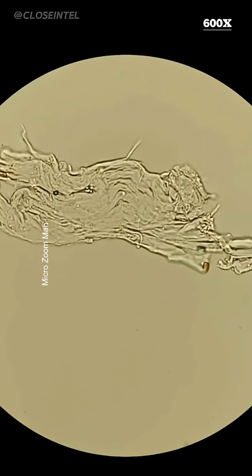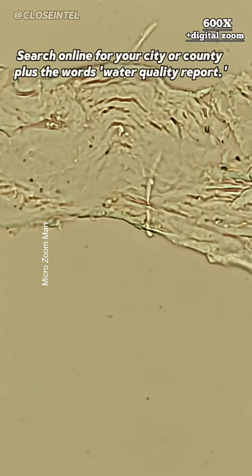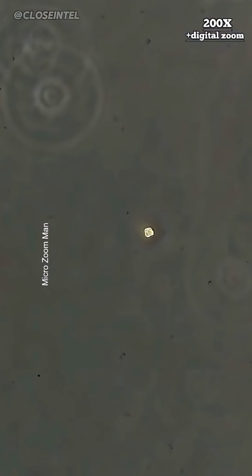Of course, my tap water doesn't represent all tap water. Everyone's water will be a bit different. If you're curious about your own, you can usually find a water quality report from your local utility online. So while seeing tiny particles under a microscope might be unexpected, it's a normal part of treated tap water. The key takeaway is the effectiveness of water treatment in keeping the water safe from harmful levels of living organisms.